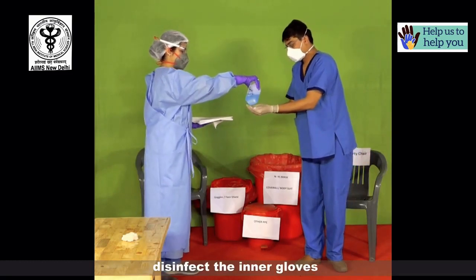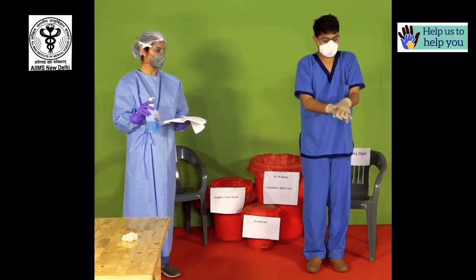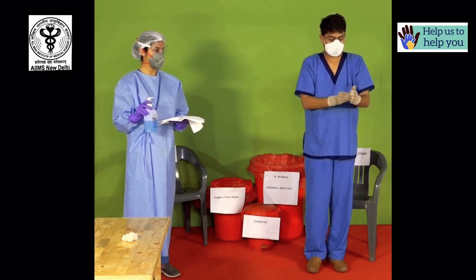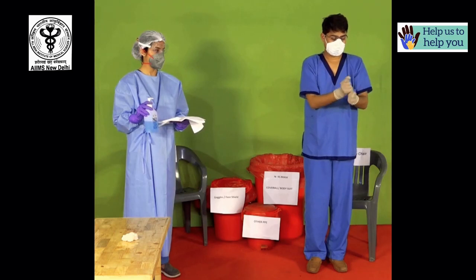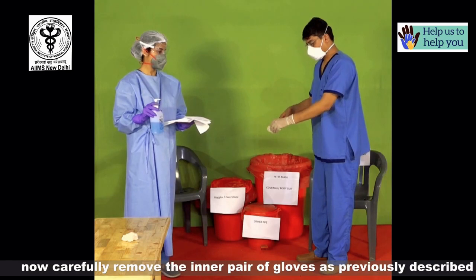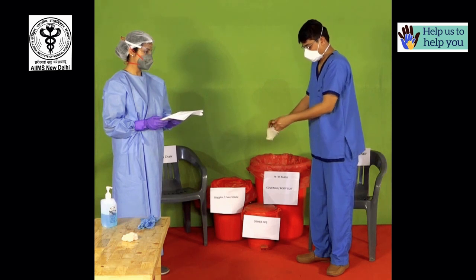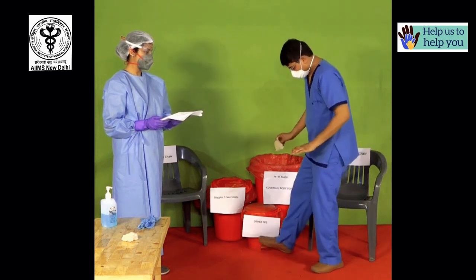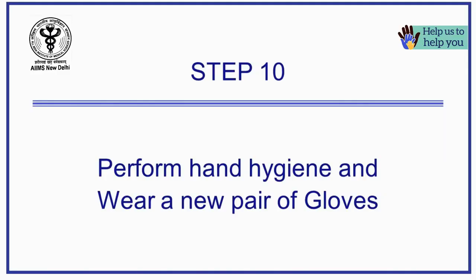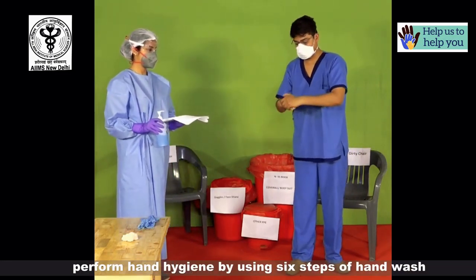Disinfect the inner gloves. Now carefully remove the inner pair of gloves as previously described. Perform hand hygiene using the 6 steps of hand wash.